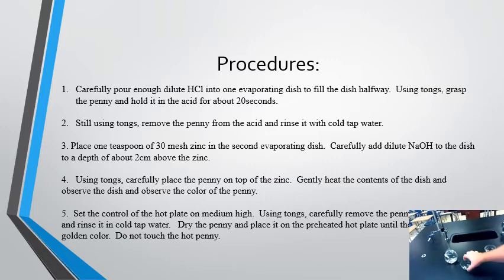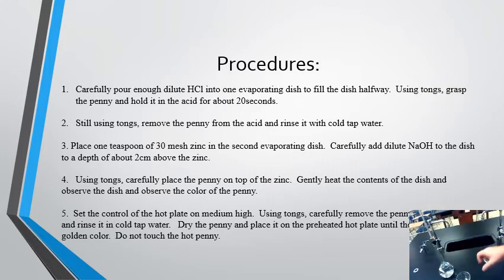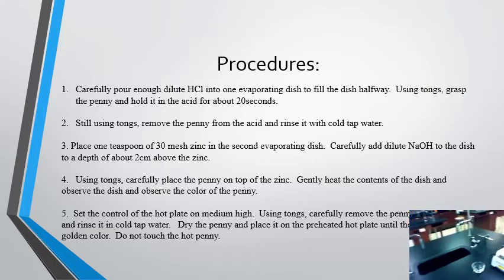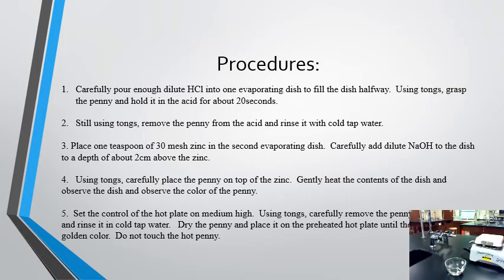And in the meantime, what we're going to do is take our penny and place it into the hydrochloric acid. So I'm going to do this here really quickly just so you guys can get a sense of it. Let me set this down here and get it where you guys can see it. I'm not going to put it all the way in. I want you guys to use the tongs to do this, but I just want to show you what you're going to see. I'm going to place the penny in here for probably around 20-30 seconds, something like that.